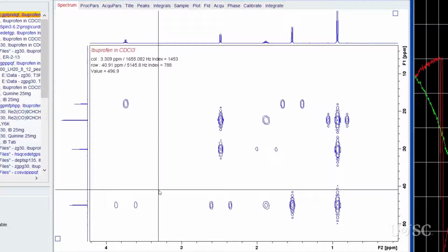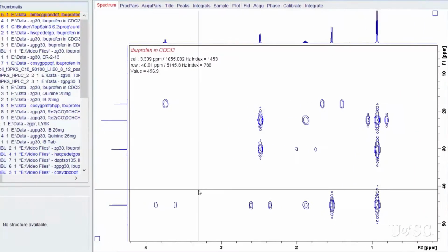However, the cross-peak intensity is proportional to the number of protons, so a suppressed single bond artifact of one resonance could be close to the intensity of neighboring protons. To help interpret the results, we are going to use information we gained from the 1D spectra, COSY and HSQC results. Please review those videos to help follow along with the assignments made here. We are also going to use our knowledge of basic C13 chemical shifts.